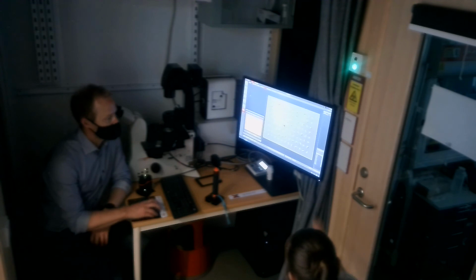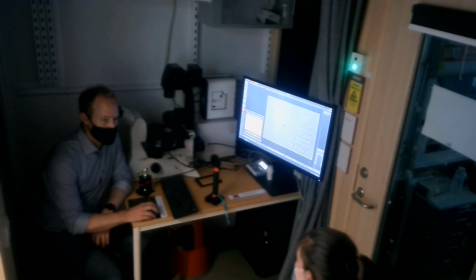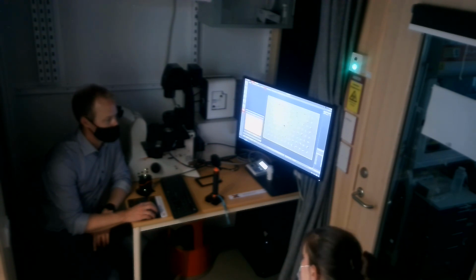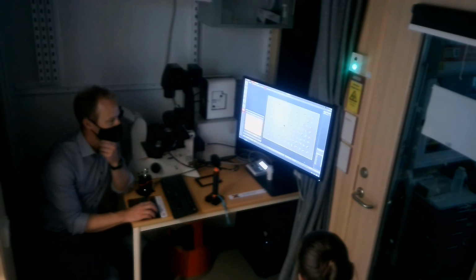And it always gives us the time, how long it's gonna take, right? Is it fairly accurate? Depends. It's not always. I think that the bigger the experiment, I have a feeling the more wrong it might be. So I'm not really sure. I never tested it. It would be interesting to hear if you're gonna test it and just have a look at that. That would be interesting to hear how accurate it is for you.